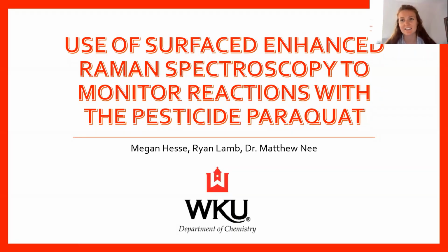Hi, my name is Megan Hesse, and I am a sophomore chemistry student at Western. And today I will be presenting on the use of surface-enhanced Raman spectroscopy to monitor reactions with the pesticide Paraquat.